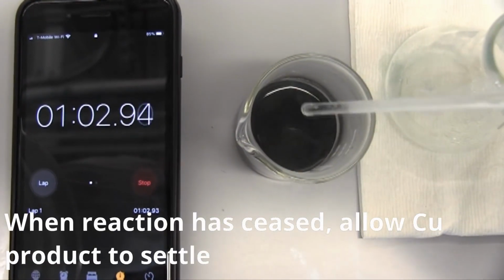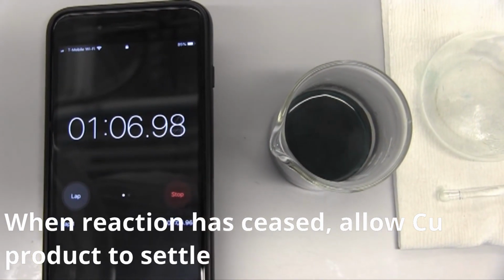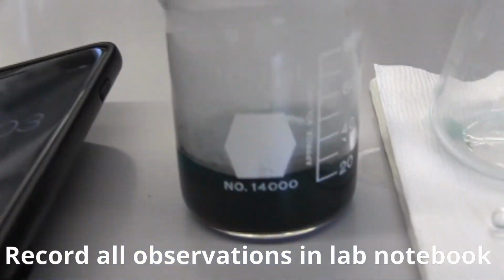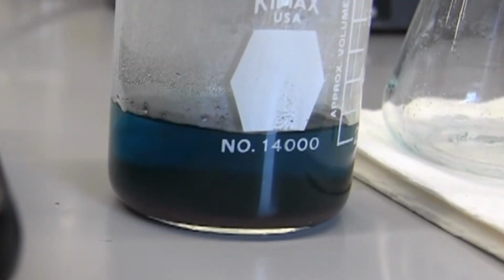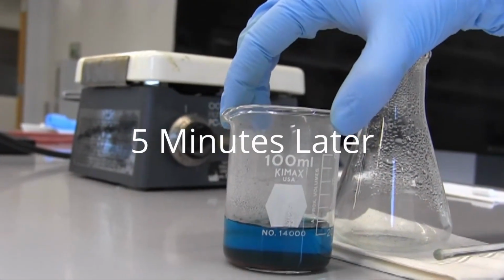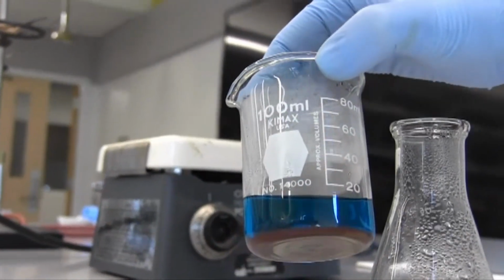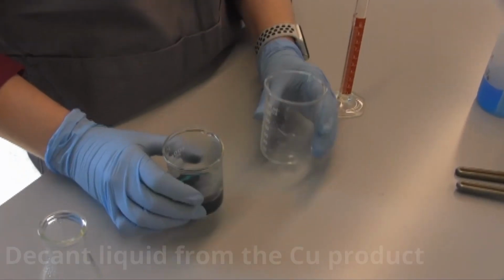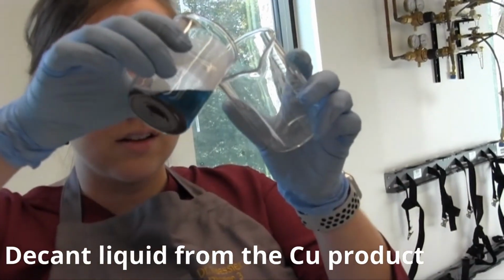When the reaction has ceased, allow the copper product to settle. Be sure to record any observations in your lab notebook. Once the product has settled, carefully decant the liquid from the copper.